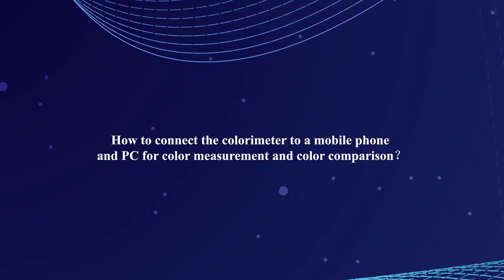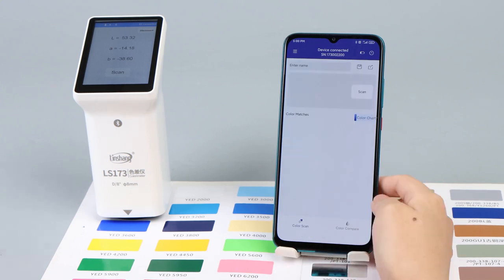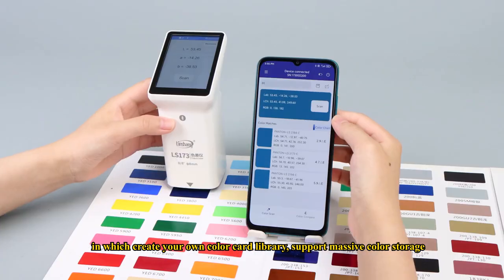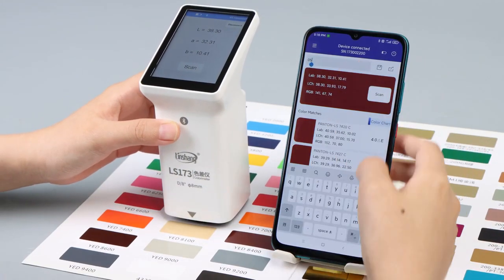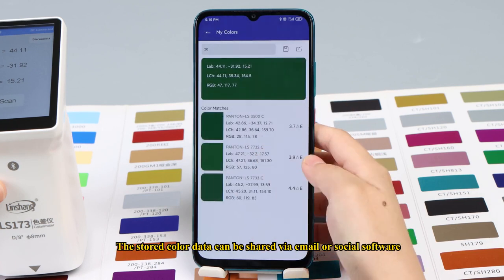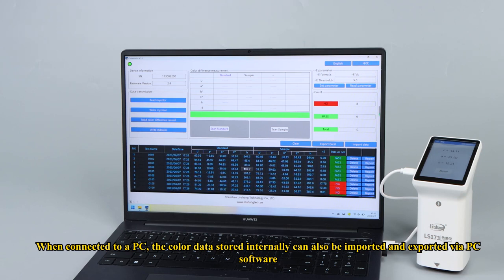How to connect the colorimeter to a mobile phone and PC? It can be connected to a mobile phone app via Bluetooth, where you can create your own color card library with support for massive color storage. The stored color data can be shared via email or social software. When connected to a PC, the color data stored internally can also be imported and exported via PC software.